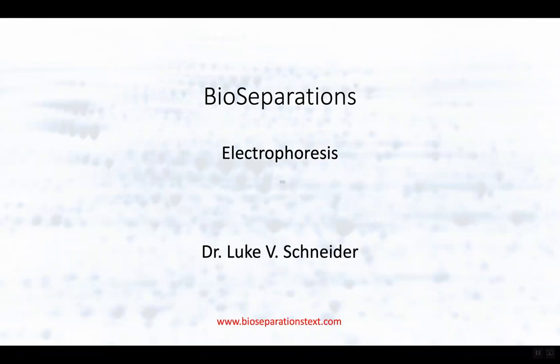In this lecture on bioseparations, we talk about another major process that's used for separation of biological materials, and that's electrophoresis. There's a lot of different types of electrophoresis. Electrophoresis is covered in chapters 10 and 11 of the textbook. Chapter 10 talks about the models for electrophoresis, how it actually works, and in chapter 11 we talk about the differences of different types of electrophoresis.